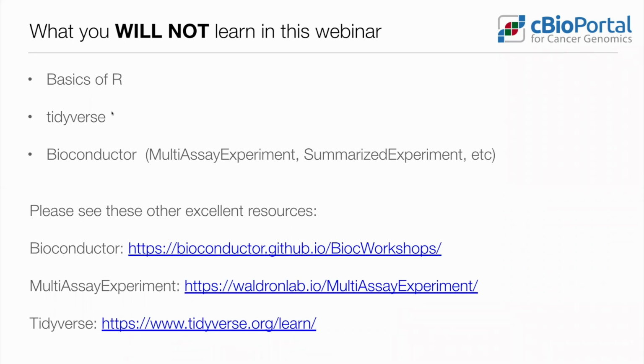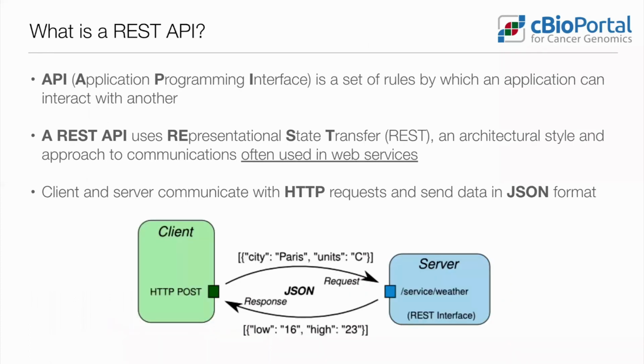We also will not really be talking about the introduction to Bioconductor. cBioPortalData is an R package that is part of the Bioconductor universe, a set of packages related to biological data analysis. All these different packages have great resources that you can find here, and you can read up more about it. I recommend you do so if you're not familiar with that yet. That being said, we will continue.